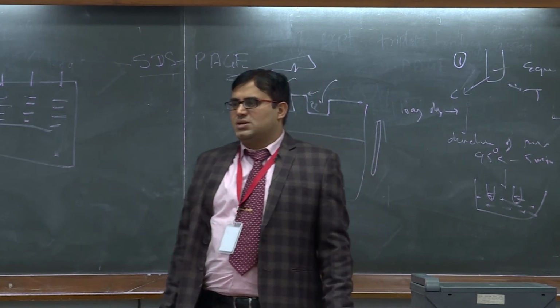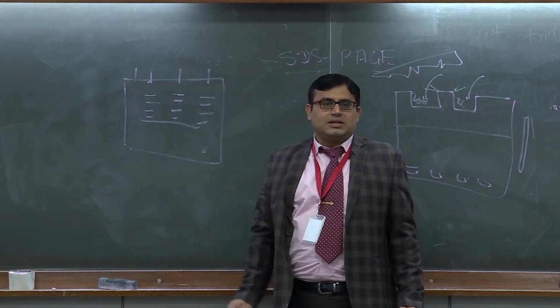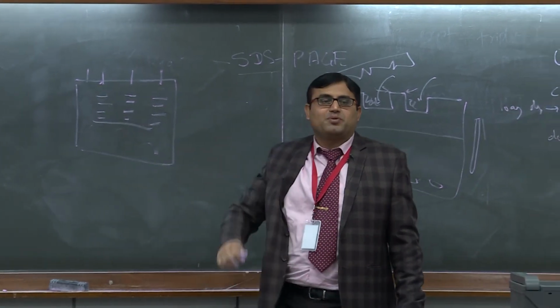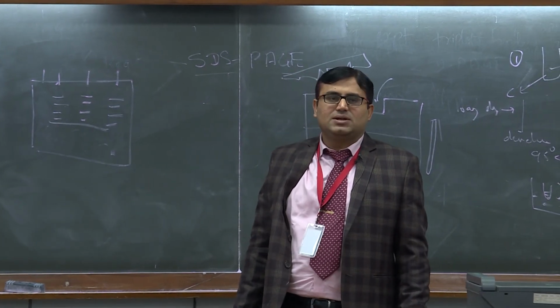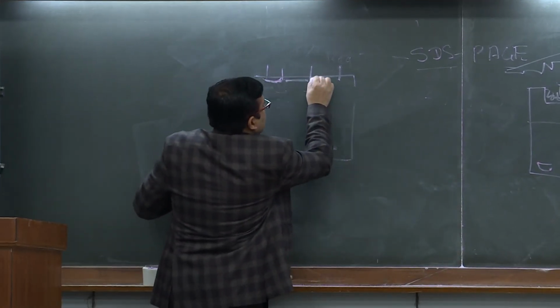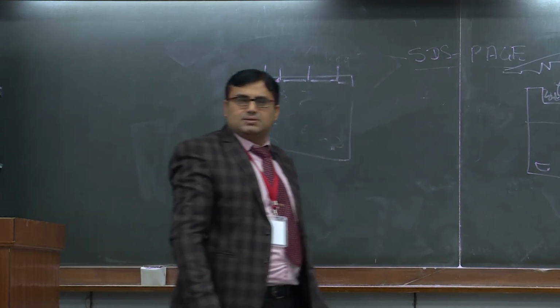So there are two reasons. One is that maybe at this step itself we stopped running. The second reason is the gel which you have prepared, most probably this lower part is not casted perfectly. Many times it happens that when you run SDS Page, you will get protein like this.